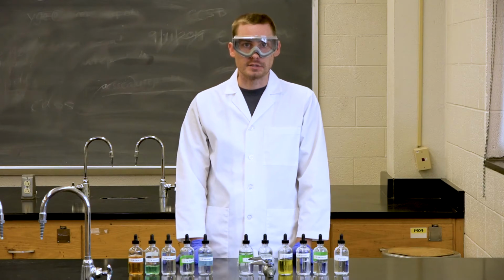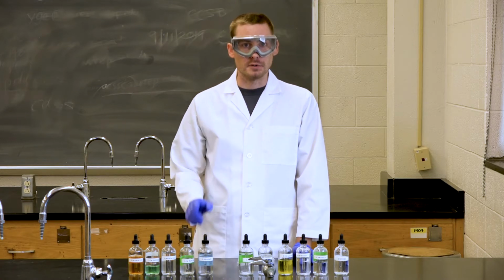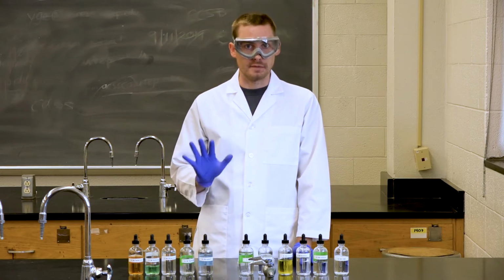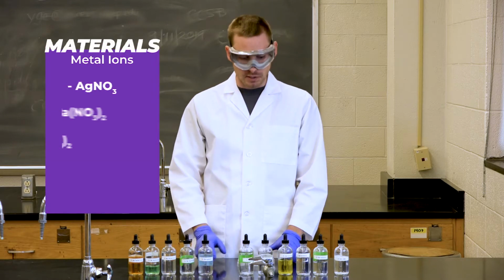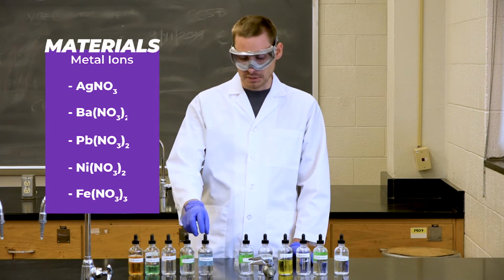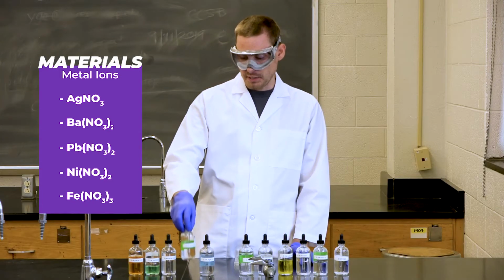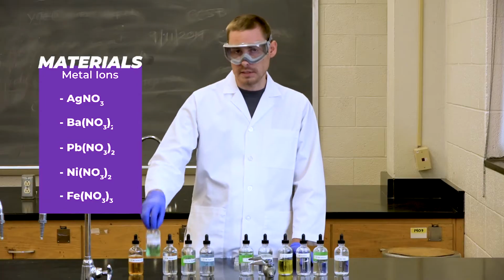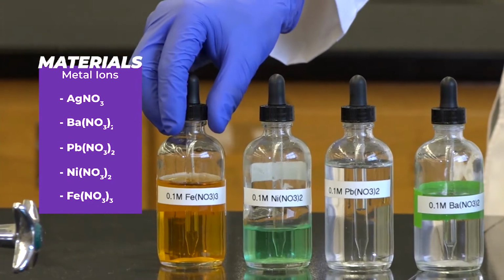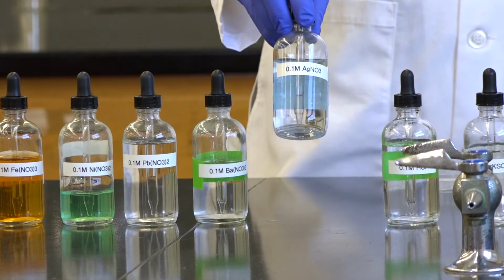So this lab has 3 parts. We'll be doing the first 2 parts in this video, and for the first part we'll only be doing one of the ions out of the 5 ions that you will be doing in your lab. For this part, we will need 5 ionic mixtures: silver nitrate, barium nitrate, lead nitrate, nickel nitrate, and iron nitrate. I will be showing you the spot test with silver nitrate only.